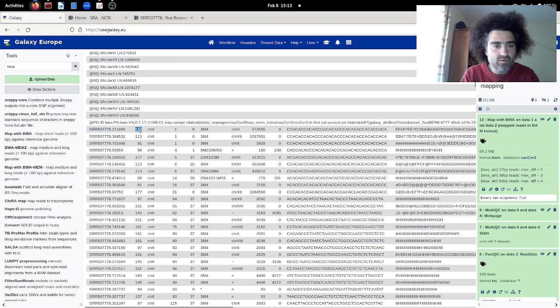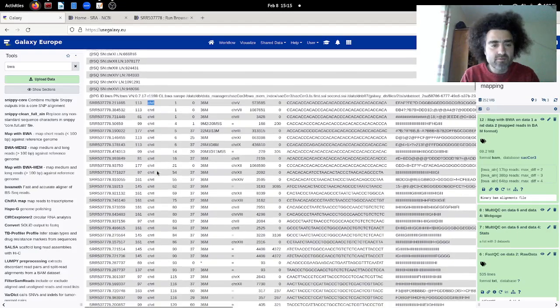and this is a code that I must explain. I will explain later in a separate video in detail, and these are actually converted binary codes, and it informs us of different things. So for example, this one might say that we have paired-end and the second mate is okay, and so on. It requires definitely a separate explanation. Now the third column is the name of the chromosome.